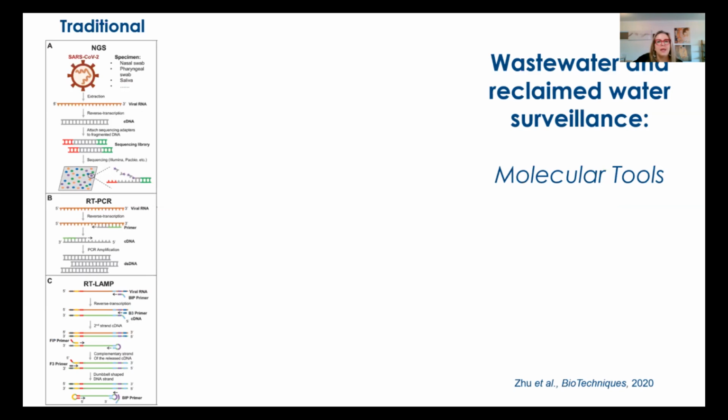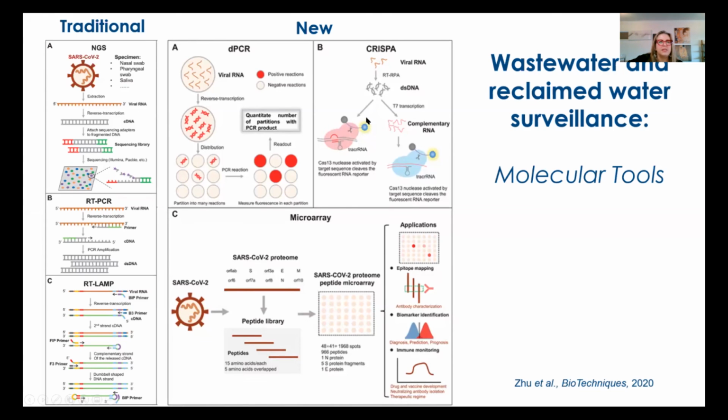In our lab, however, we use one technique because we mainly monitor in rural settings where the coronavirus is really low in quantity, if it is there, and we use the digital droplet qPCR. So what's the difference between the common qPCR, which is used for the wastewater treatment plant, and the digital droplet? The digital droplet can detect a very, very low amount of coronavirus. So we can detect even one genome in the wastewater treatment plant. So it's very useful in a rural setting, though not useful in areas which are heavily contaminated.